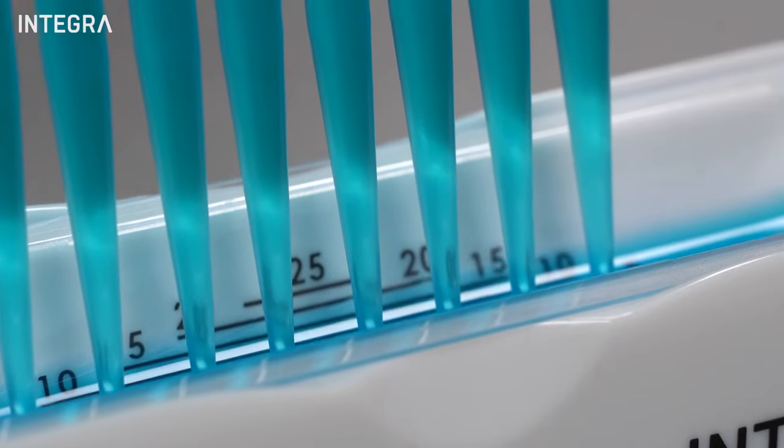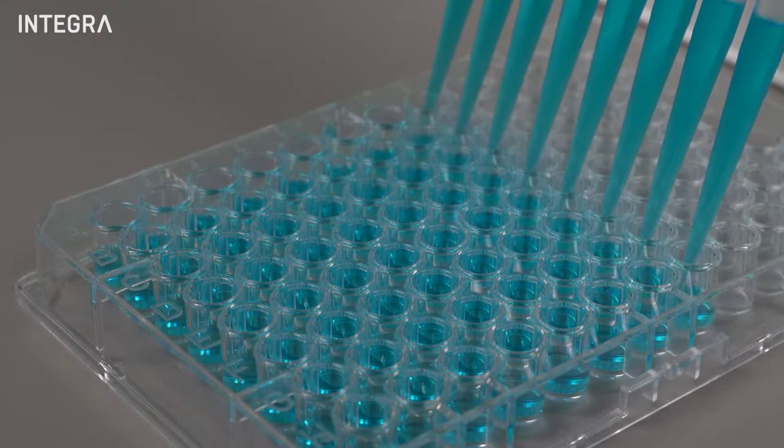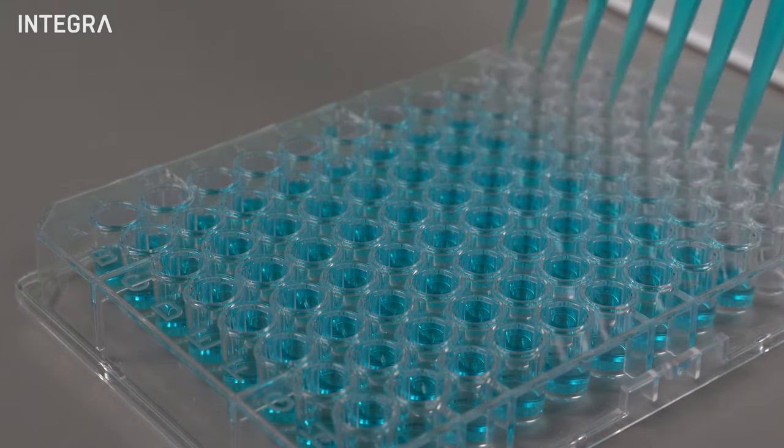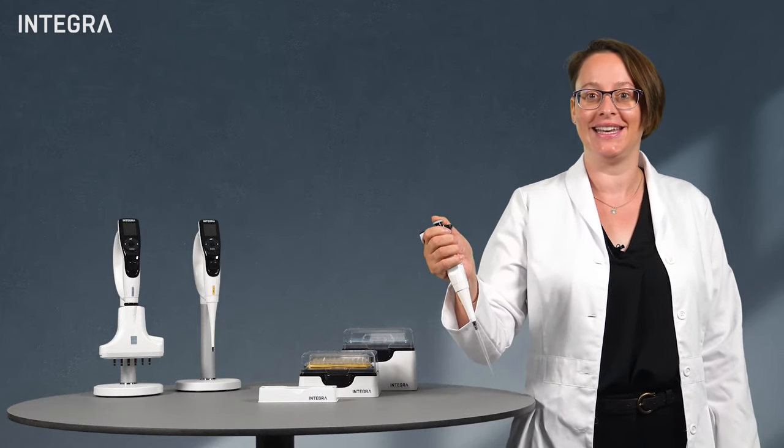Precision, on the other hand, measures how true the pipette is to a target volume over multiple dispenses. So if you dispense 300 microliters, how close is each dispense to the other? This is sometimes referred to as the CV and can be corrected with proper pipetting techniques.